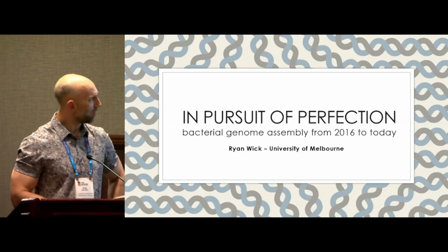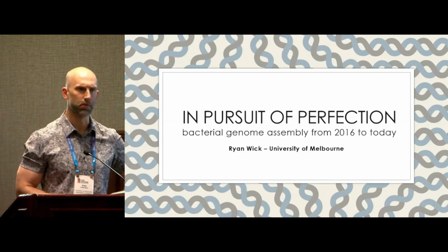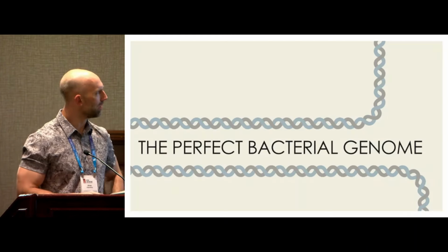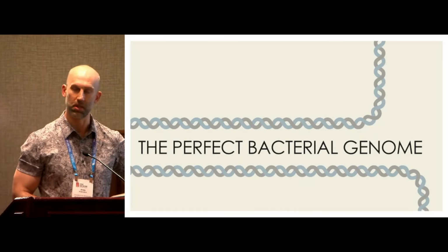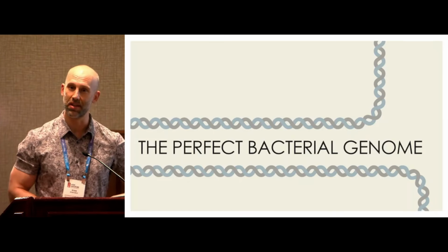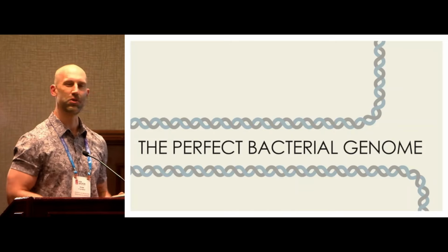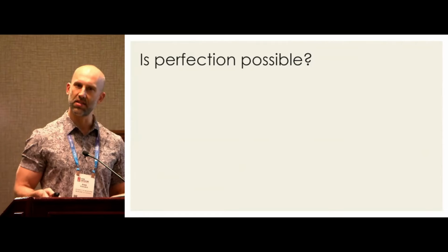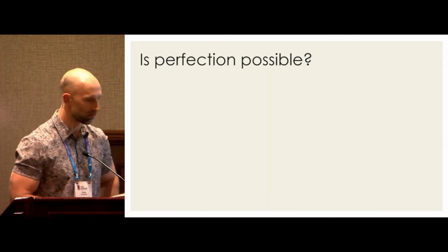Yeah, so I have been working with bacterial genome assembly for almost a decade now, and for most of that time I've been using Oxford Nanopore reads, and I've really been chasing this idea of a perfect bacterial genome assembly. And I know that's a strong word, and some people don't like that word, and a question I often get is: is there really such a thing? Can you really get a perfect assembly? And I would make the case that, yes, it is a thing, and in most cases, it does make sense to talk about a perfect bacterial genome.